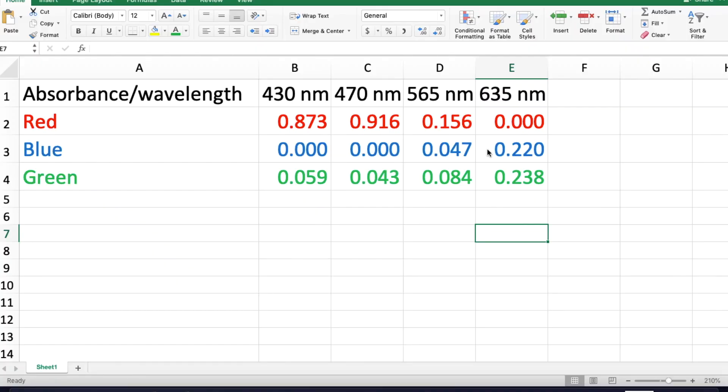The last thing I wanted to do was show you some of the data that's generated. The data table in front of you is from the colorimeters. You're limited to four individual wavelengths. However, you can see that there's a great difference between absorbance based on the different colors of the solutions. So if the colorimeter is all that you have, the kids can still decide which wavelength would be the best one to measure the absorbance at.